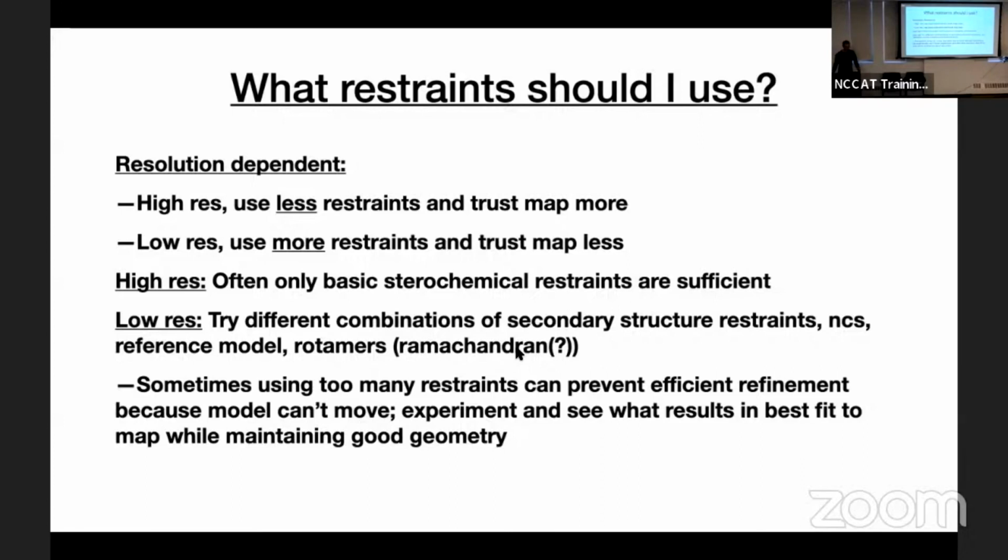Yeah, I mean it definitely happens. For all of these metrics there will be exceptions. Say for the Ramachandran plot, I did a lot of work on antibodies before, and in the light chain of antibodies there's this one residue that always has it. It's been a while since I worked on antibodies, but I'm forgetting if it's a cis peptide. The bottom line is that there are, I'd say, on the order of 1 in 100, 1 in 200 kind of numbers.